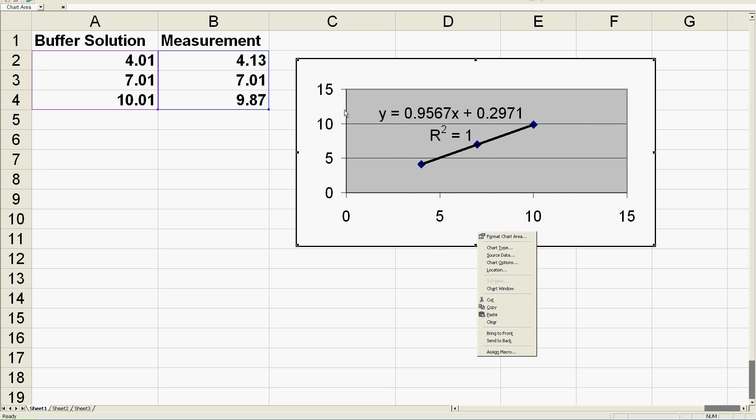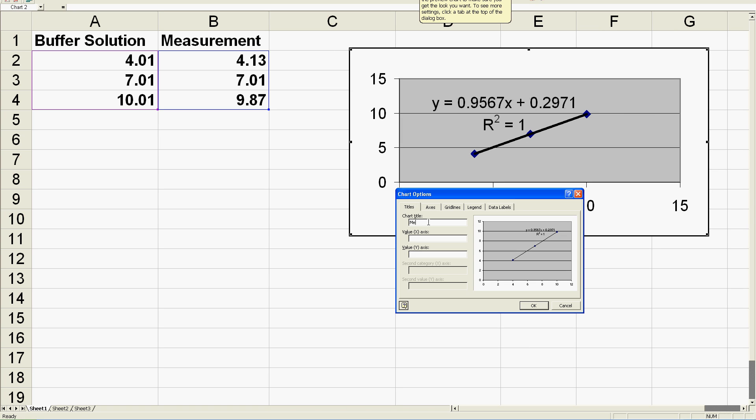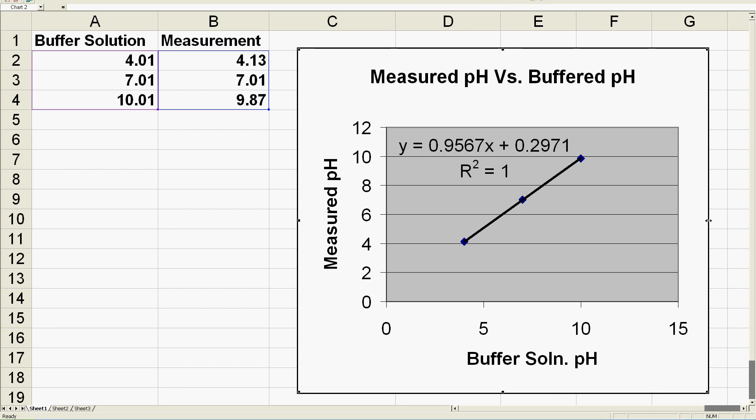Then simply add a linear trend line through all the points. This is also known as a linear regression. Now you have a calibrated curve that compensates for the non-idealities of your glass electrode.